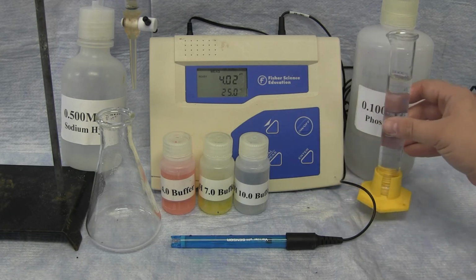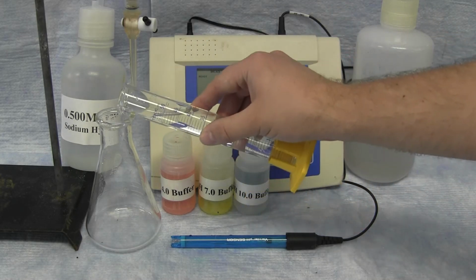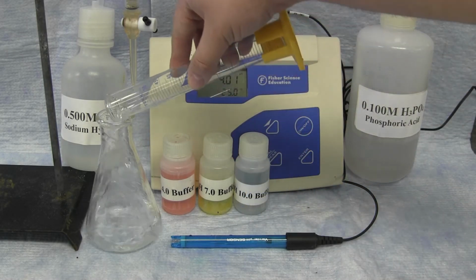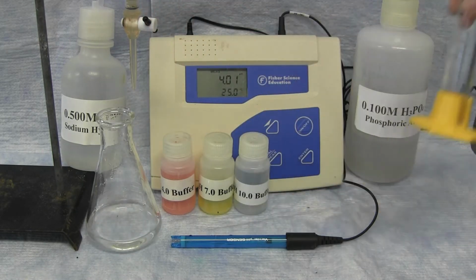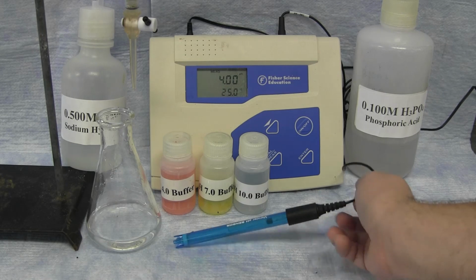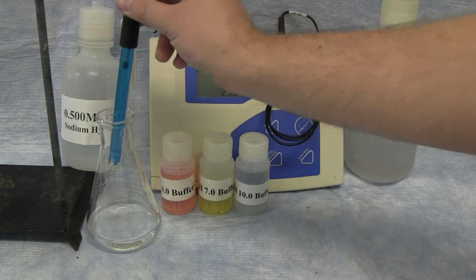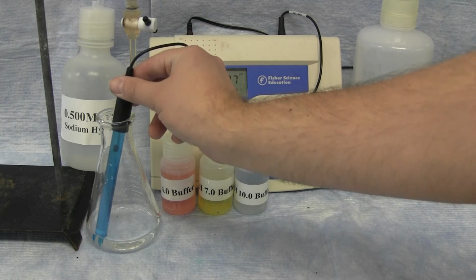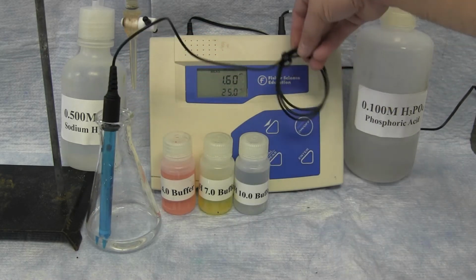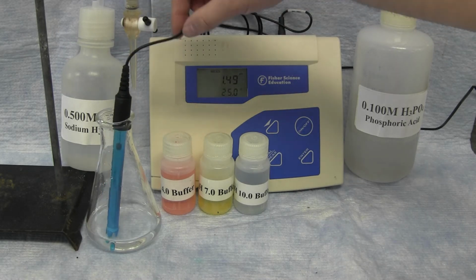You'll measure out 50 milliliters of your 0.1 molar phosphoric acid solution and add that to your Erlenmeyer flask. You can then measure the pH of this phosphoric acid, with 0 milliliters of the sodium hydroxide added.